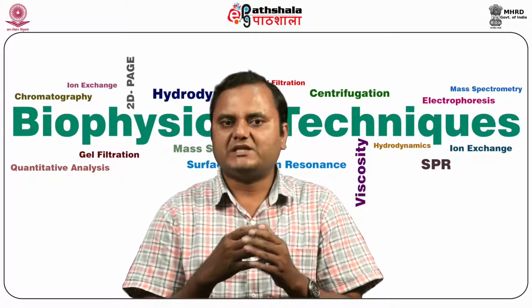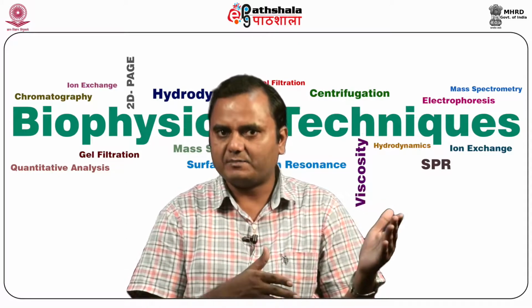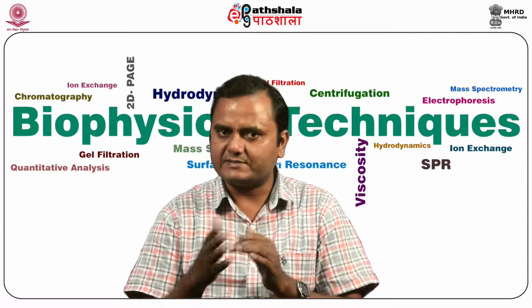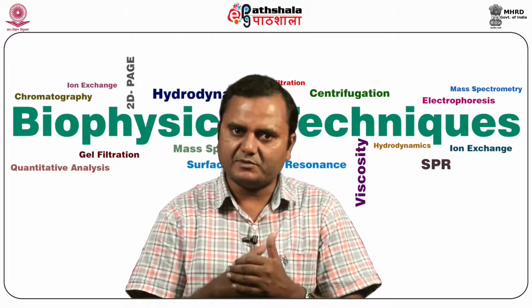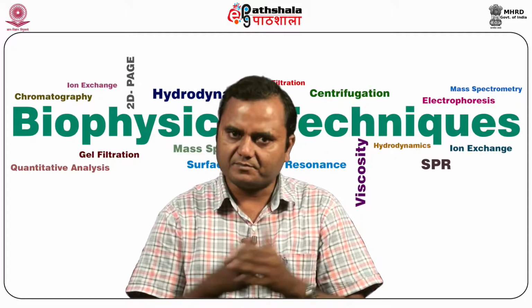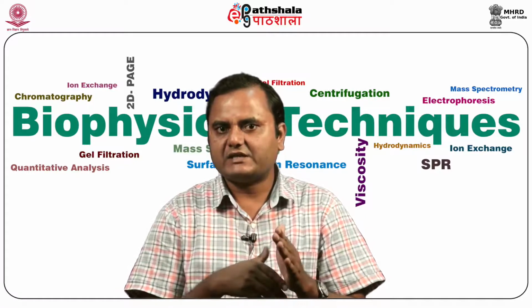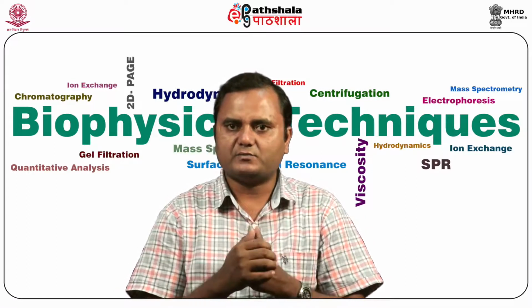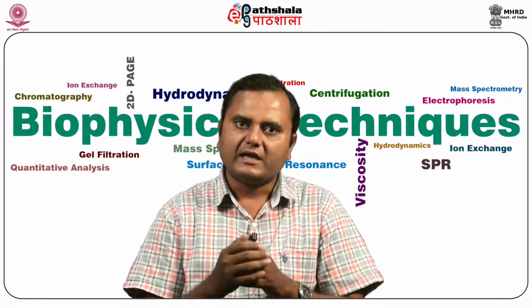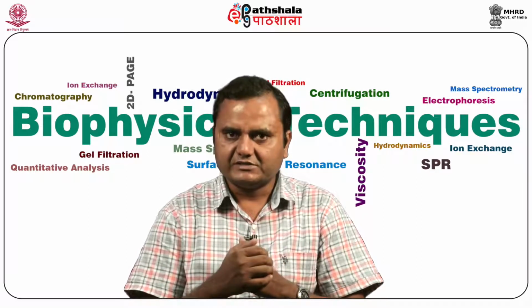Then it uses relatively pure sample. If you go for the analytical purpose, people prefer to use pure sample, and if you want to use it for separation, then some impure sample can be used for the fractionation of cellular components, as in the case of preparative centrifugation. The analytical centrifuge has an inbuilt optical system to analyze the movement of molecules during the centrifugation process, and it runs at a speed of more than 1 lakh g.